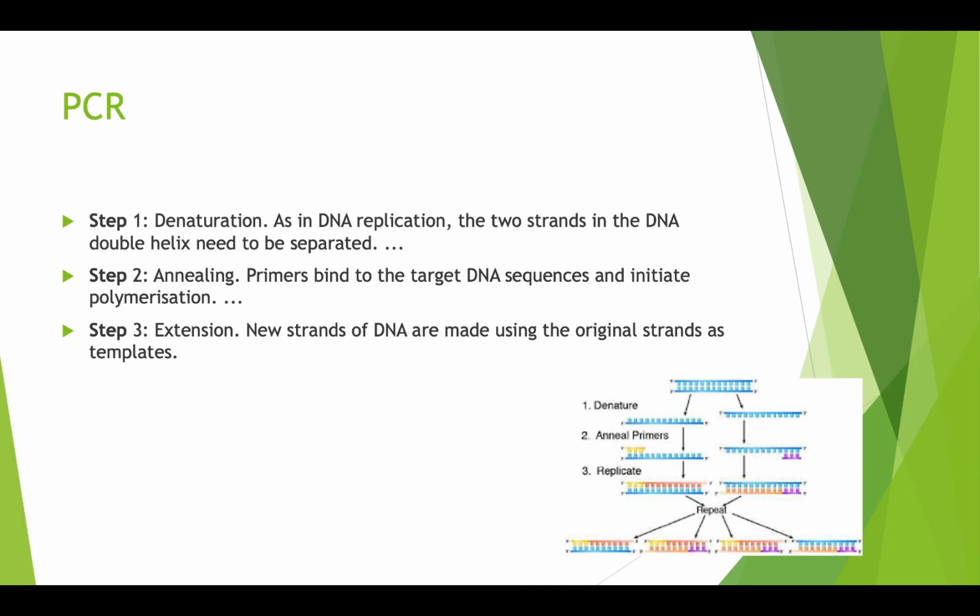So you can know the melting temperature yourself from the website, and then you can fine tune your temperature. You might raise it a bit, lower it a bit, 5 degrees above, 5 degrees below, and then you can do multiple PCRs, 10 PCRs, and find where you got the best yield, and then use that temperature all the time.